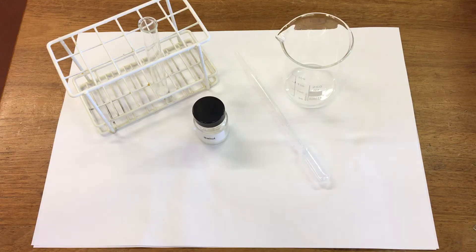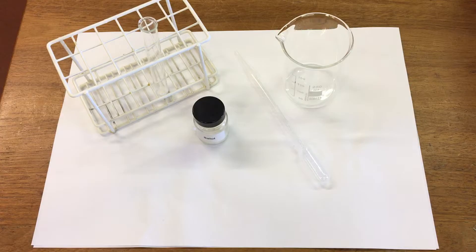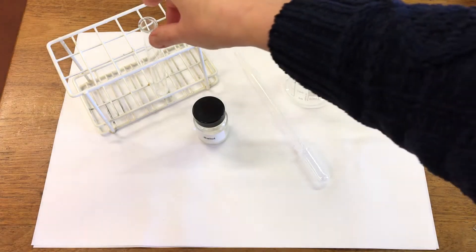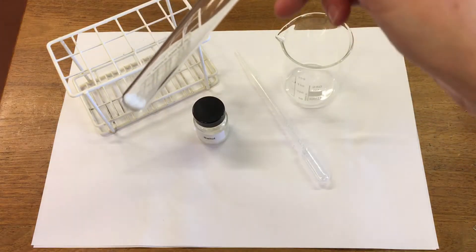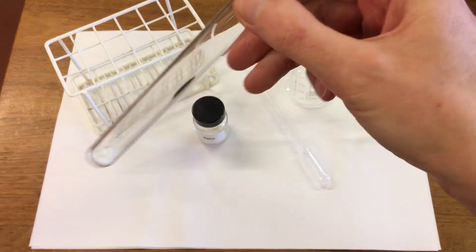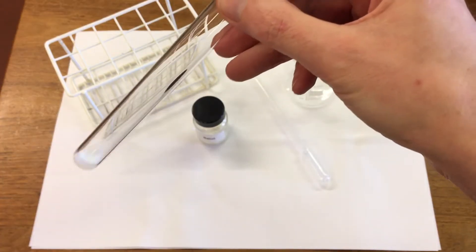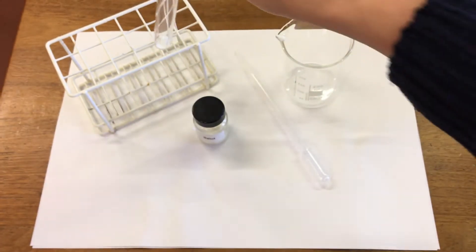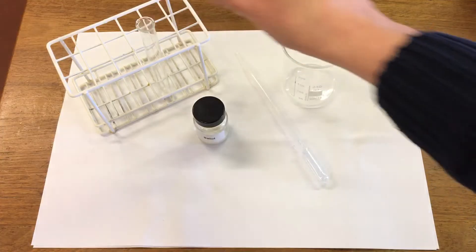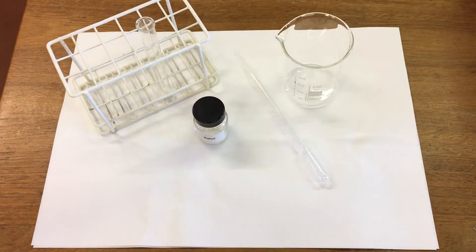In this experiment we're looking at changes of state. We're going to observe the white solid salol. We've got some of the salol in the test tube here so you can see it's solid. We're going to observe it at different temperatures and see if it changes state.